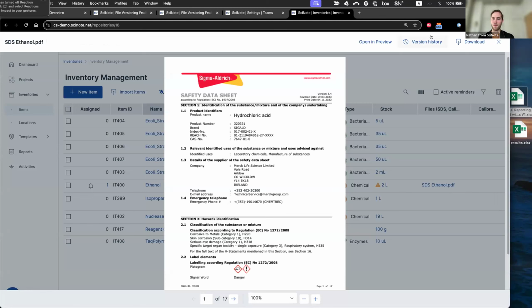So those are all the main use cases we shared. I'm going to pass it back to Arun for 1 second. There might be one other use case we'll highlight. And then if anyone has any questions as well, please feel free to upload them in the Q&A. If there are any files that you use in your day-to-day that you're curious how this would work for you, if there's any other questions regarding this feature, please let us know.